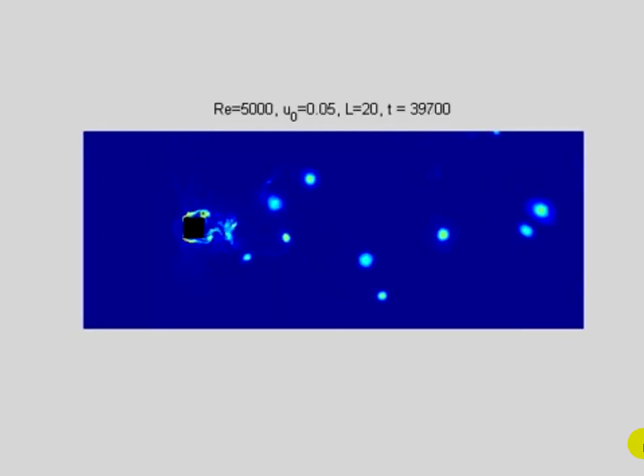So remember, this is exactly the same problem. What's being changed is the scale of the problem, by changing the diameter. So if I have a small photobioreactor represented by the first example, cells will have a good time, and if I increase the scale, I have very dangerous regions where cells may die, okay?